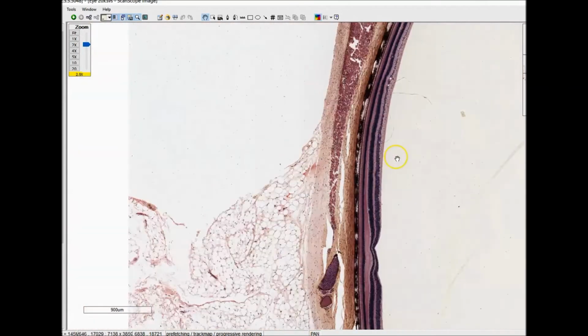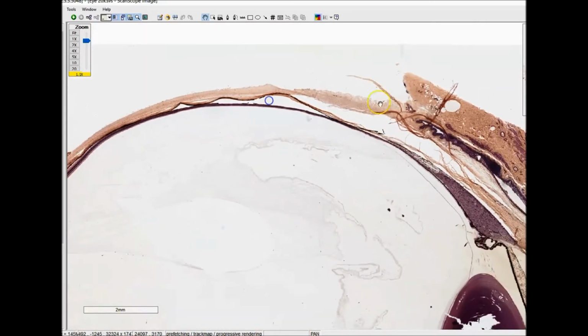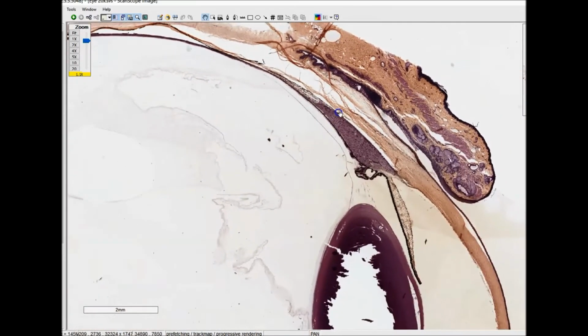And if you follow it around towards the anterior segment, it includes the ciliary body and its processes, the iris, and the lens, which is pretty blown out here. The whole center has failed to be properly fixed and embedded and sectioned and so on.